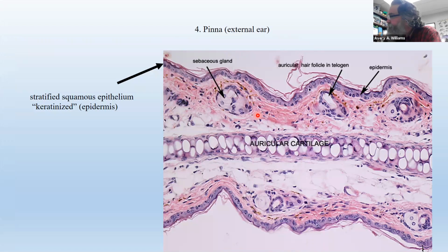It's just another cool thing to see, some adipose connective tissue. Now, this is our fourth slide. The ear, the pinna. On most non-humans they call it the external ear, pinnae. On humans, they usually refer to it as an auricle. But only mammals have external ears.